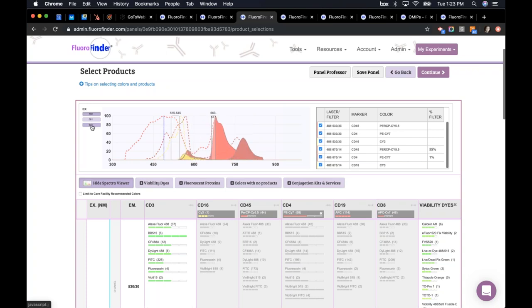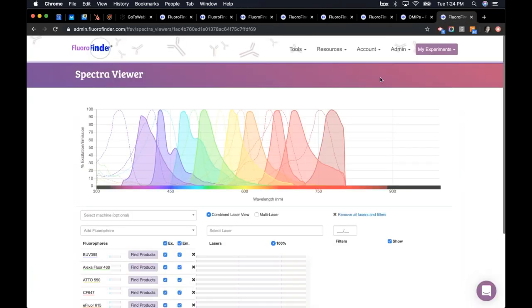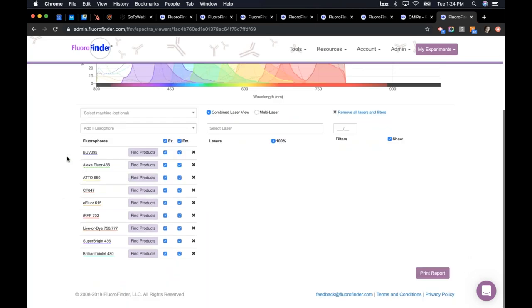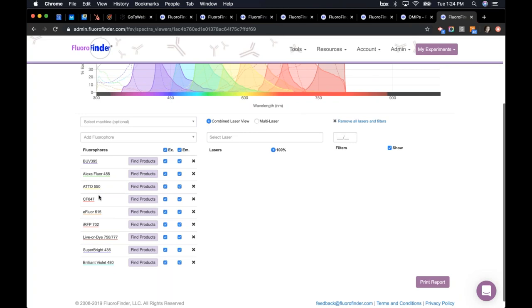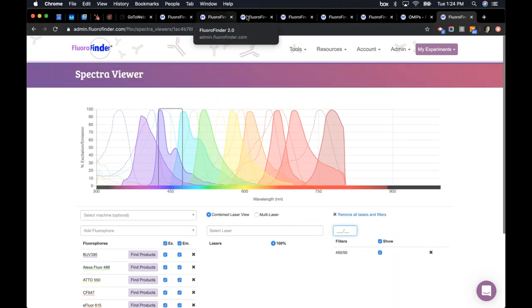For those who want to see a cleaner Spectra Viewer, we just launched our standalone Spectra Viewer, accessible from our main site under Tools > Spectra Viewer. You can enter your laser and filters, or pre-select a cytometer. It has BUV dyes, Alexa Fluors, Atto dyes, CF dyes, IR dyes, Liver dyes from Biotium, Superbrite from Thermo — all on one Spectra Viewer. We have about 650 fluorochromes in here, so one place you can see everything.